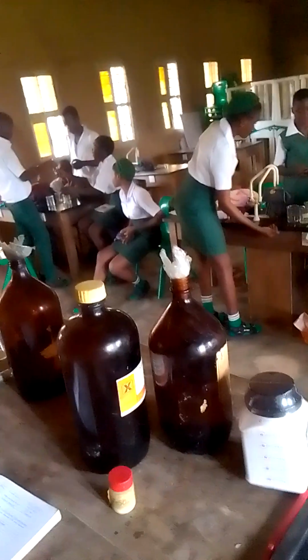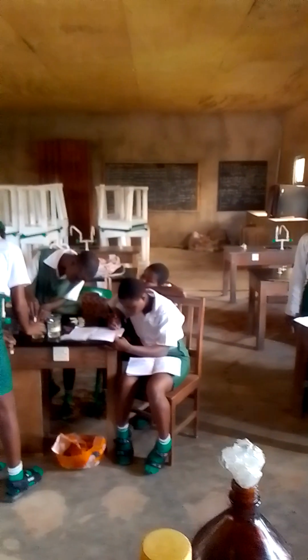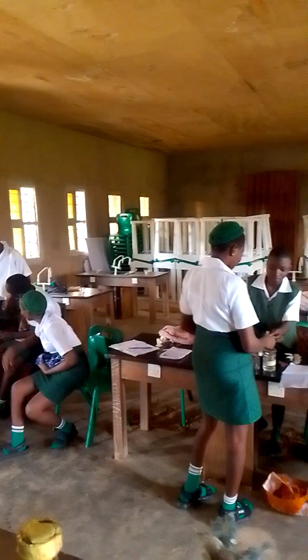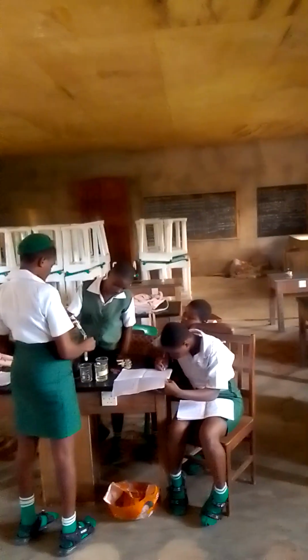Now, the white precipitate is formed in that test tube. Put in that hydrochloric acid. Come, let's see what happens. Pour it inside, in drops and then in excess. Let's see what happened to it.